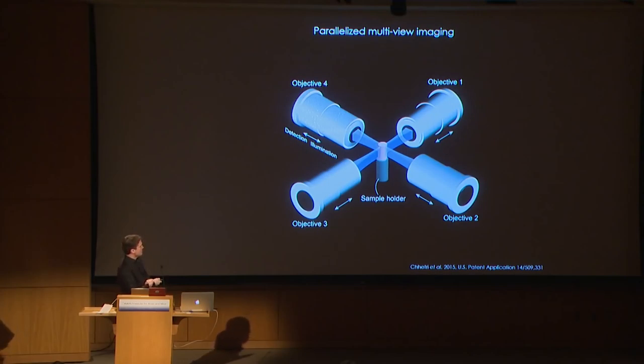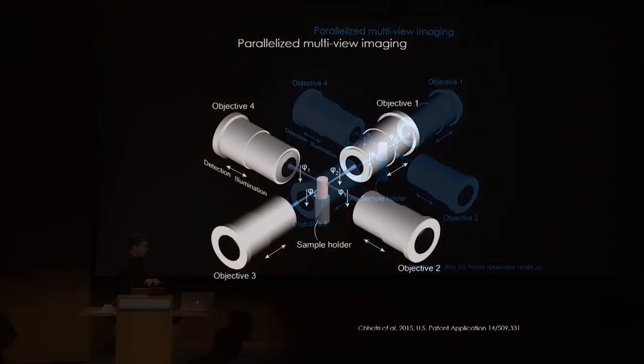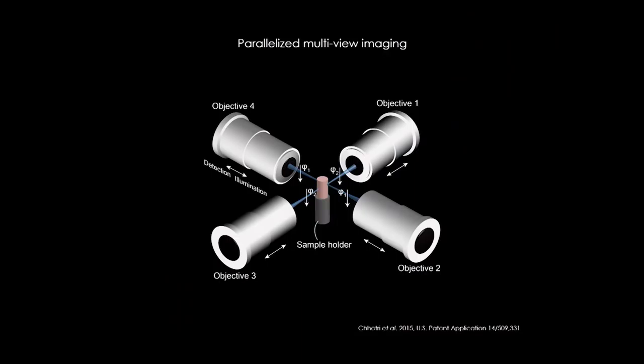So the way we can solve this is that we don't actually use light sheets in our light sheet microscopes. What we do is we send in a very, very thin pencil beam. And so then if you take this pencil beam and you scan it up and down very quickly across your plane of interest, and you just keep the camera shutter open, you get the equivalent of a light sheet. So you have a scanned light sheet.